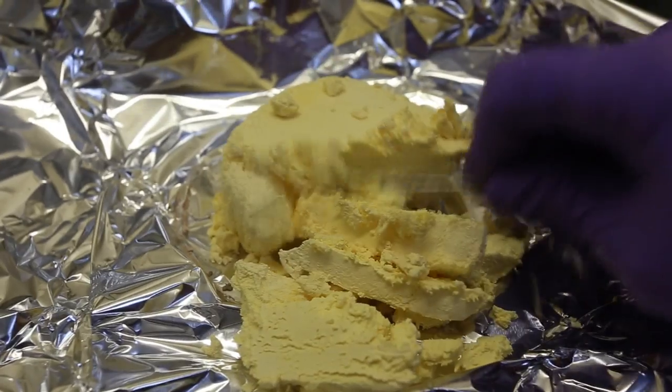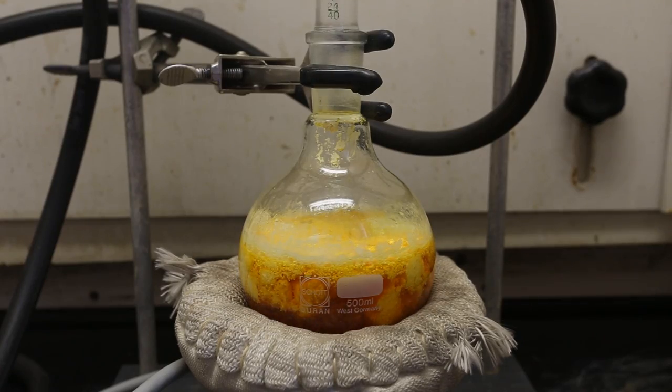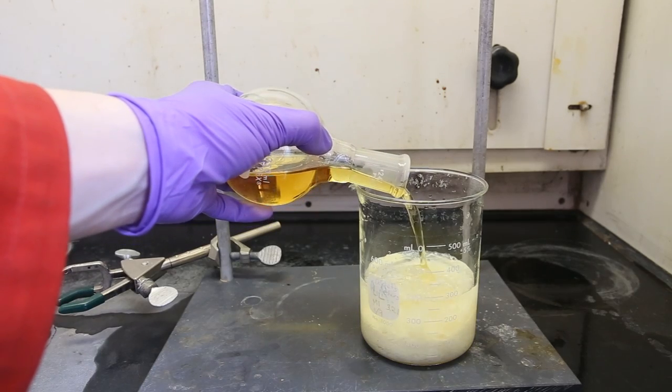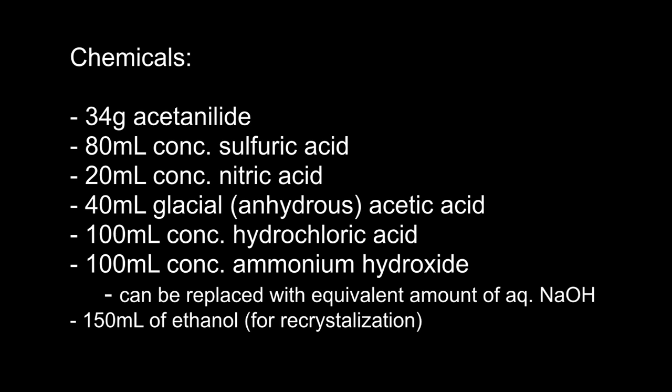Here is an example of the reaction I am talking about. Sulfuric acid is an extremely strong dehydrating agent, and with heat it is capable of tearing apart the P-Nitroaniline molecule to produce a long carbon snake. The carbon snake is made of mostly a carbon skeleton filled with a significant amount of CO2 gas and NO2 gas. This experiment actually requires a lot of chemicals, so I'm not going to read them all out.